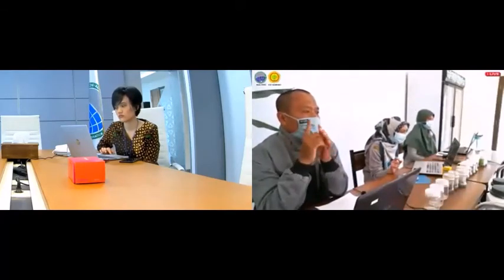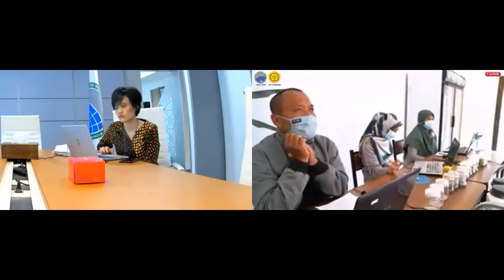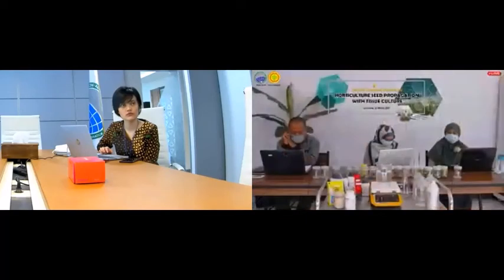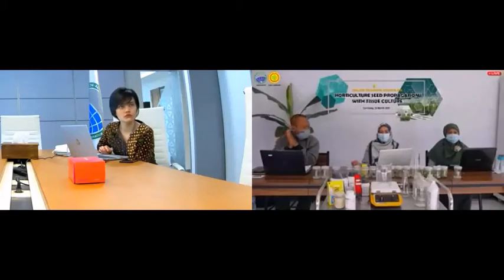After you make the culture media, wait one week and check for sources of contaminant, for example fungi and bacteria. If the culture media is clean from fungi and bacteria, you can use the culture media to plant explants.